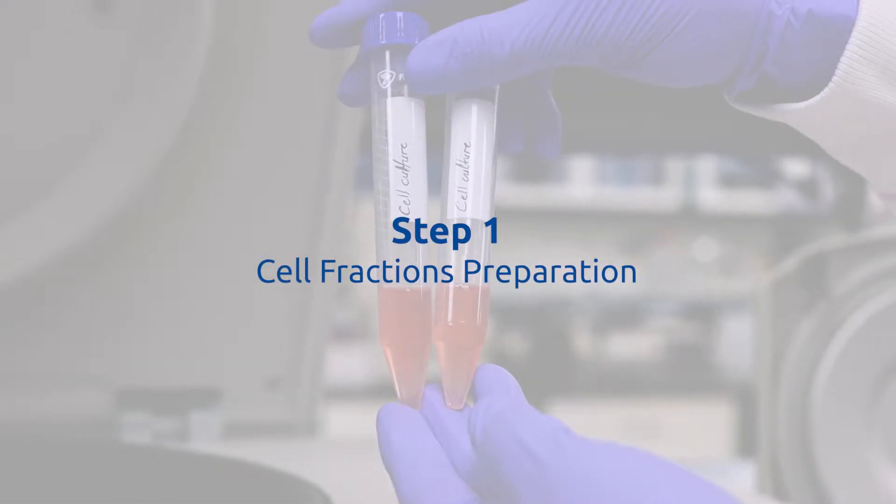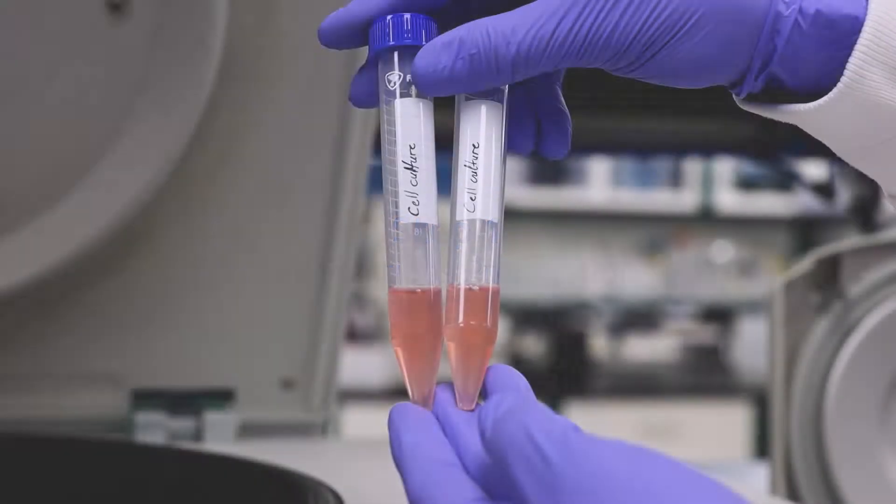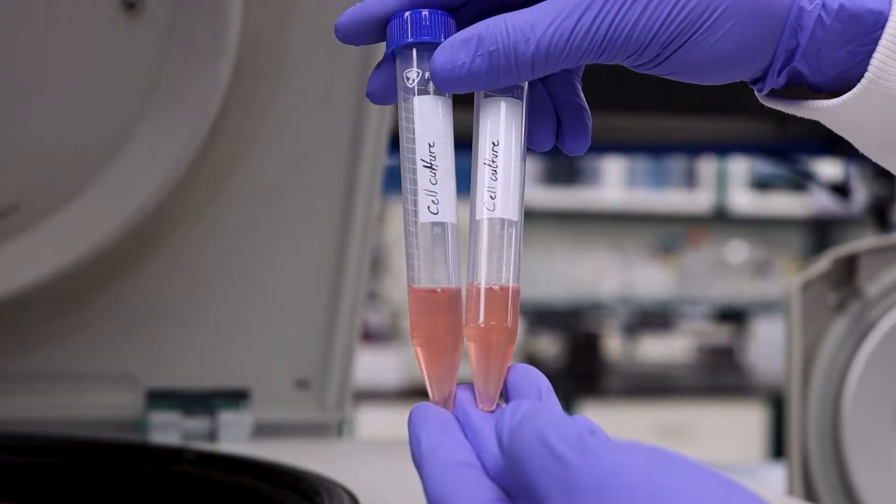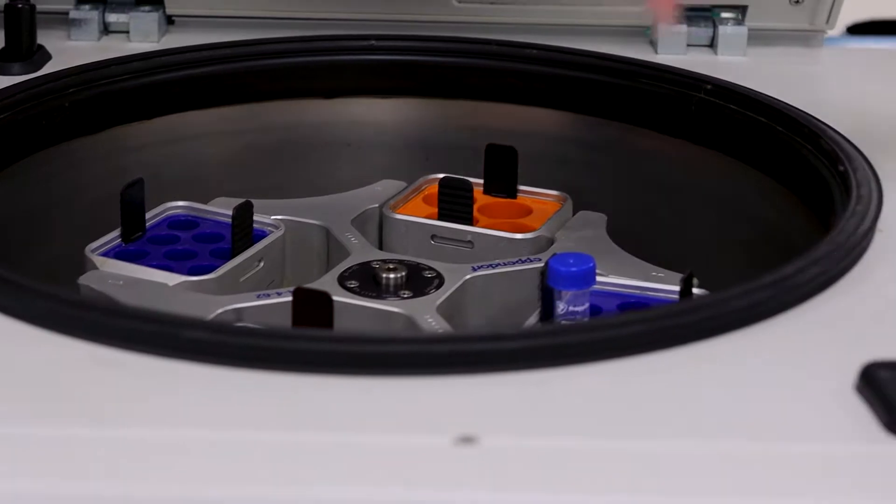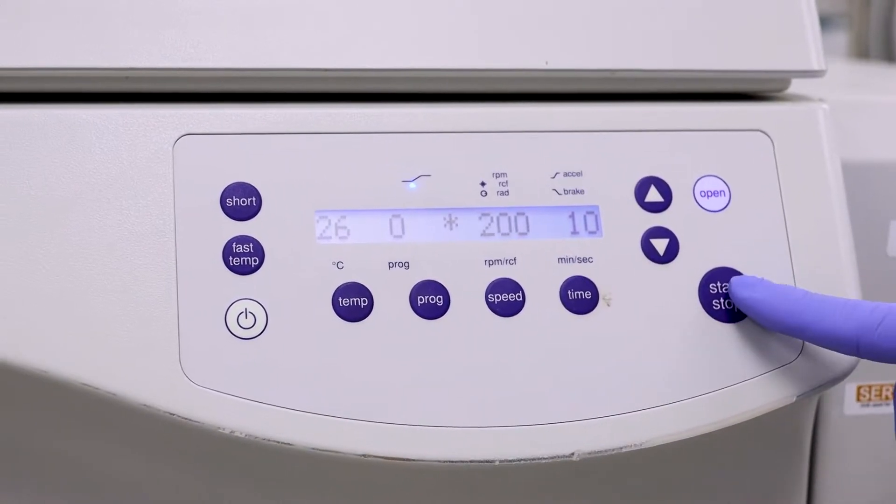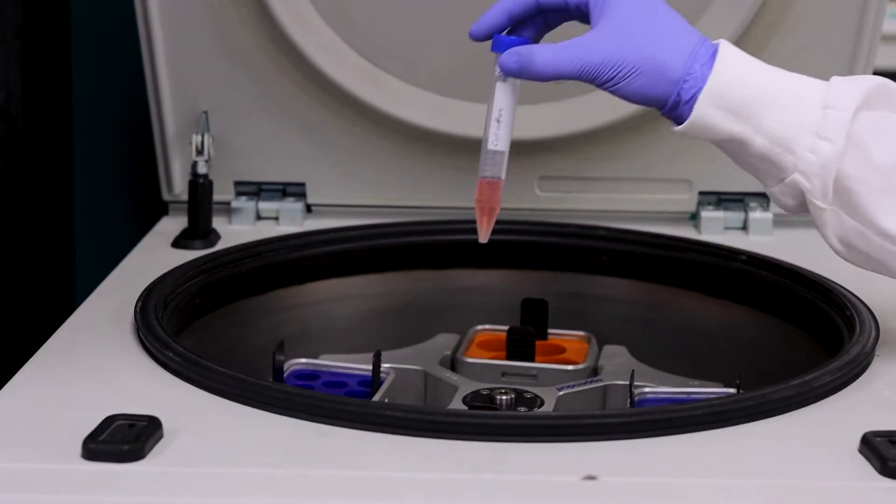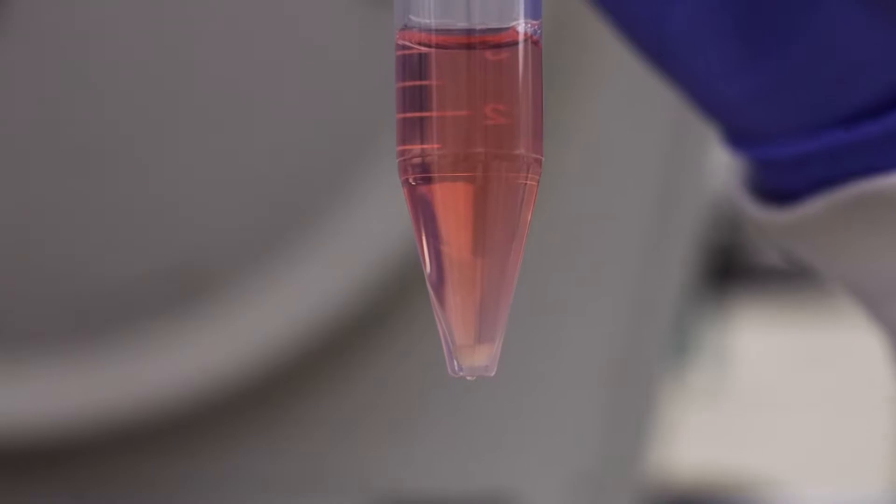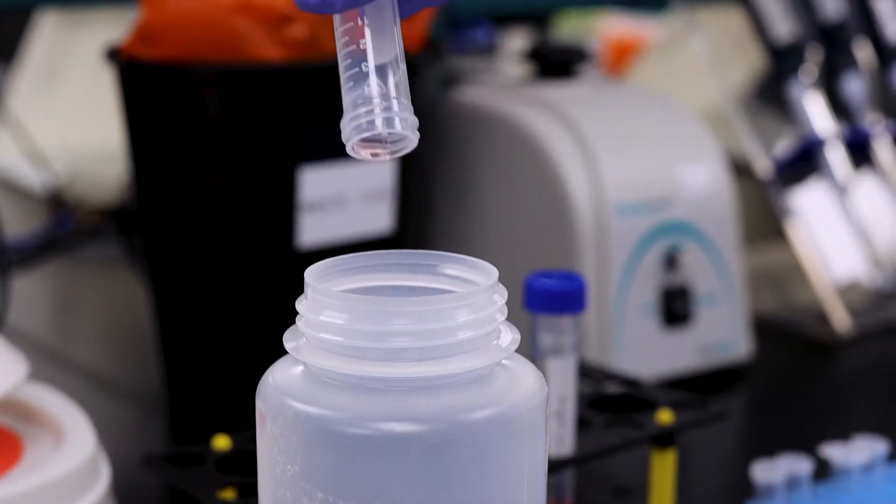Step 1. Cell Fractions Preparation. Transfer your cell suspension to an RNase-free tube, and centrifuge at no more than 200g or 2000rpm for 10 minutes to pellet the cells. Carefully decant the supernatant.